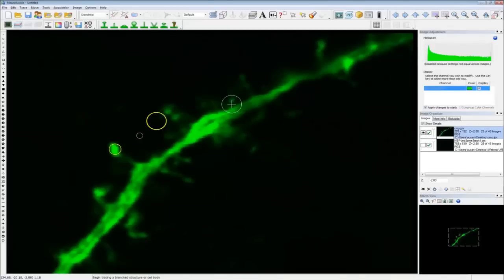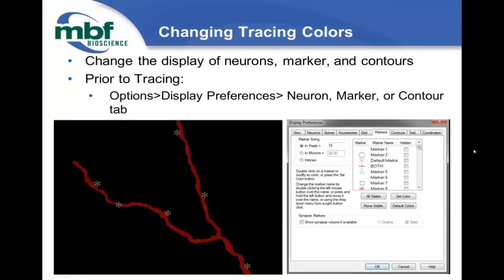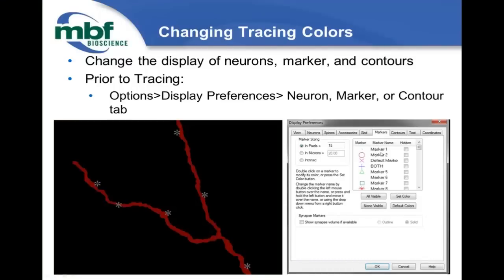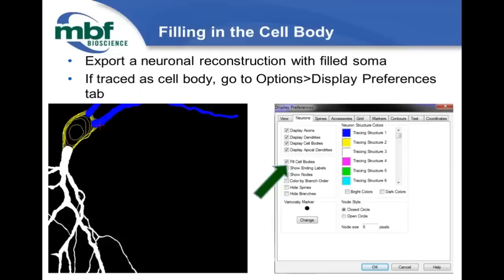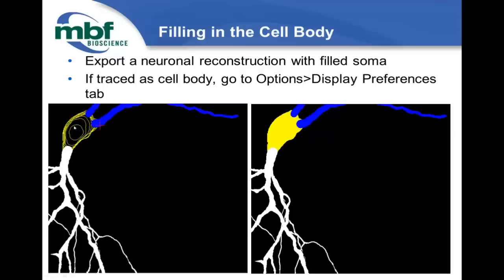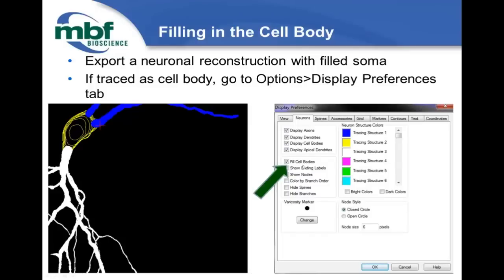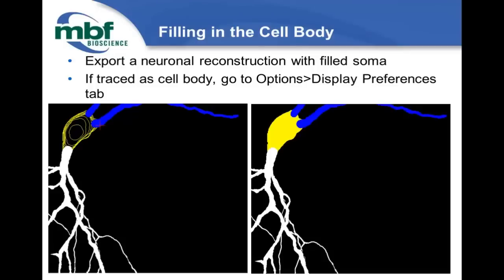For contours, you can change the contour name to match the anatomical region you're delineating and change the contour color. Now let's talk about filling in the cell body. When exporting a neuronal reconstruction, you typically want a filled soma rather than a bunch of lines traced throughout the soma volume. If you traced the soma as a series of cell body traces under Trace > Manual Neuron Tracing, just go to Options > Display Preferences and click the option to fill cell bodies.